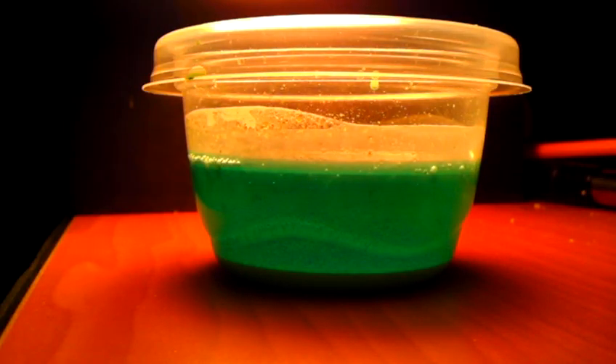This is a solution of copper chloride I made from copper and hydrochloric acid, and we're just seeing what happens when I add a little bit of 35% hydrogen peroxide to the mix.